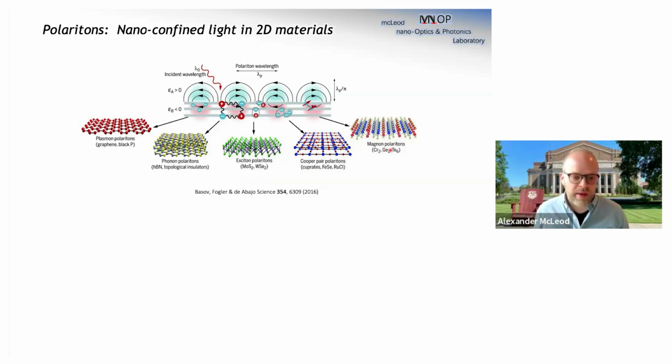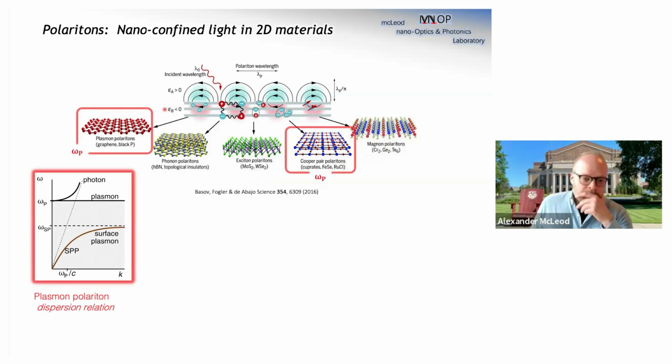This is quite an exciting time to be a material scientist because all of our favorite materials are now available in two-dimensional form, in the form of these different crystals. The wonderful thing about these 2D materials in terms of their optical response, and I'll call them quantum materials, is that as a consequence of the confinement of electrons to a two-dimensional layer, the properties of these materials are quite different from their three-dimensional counterparts. In the two-dimensional metals, like graphene and also these two-dimensional superconductors, if light interacts with these two-dimensional materials, what we end up with is a plasmon mode.